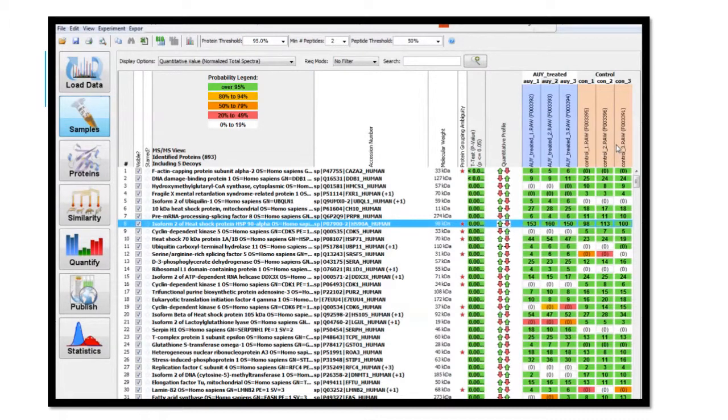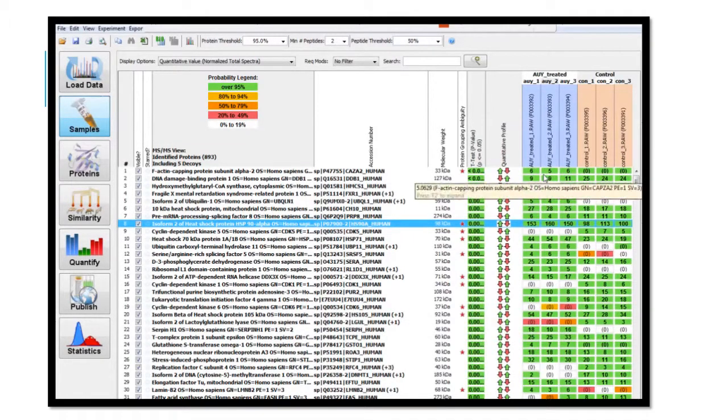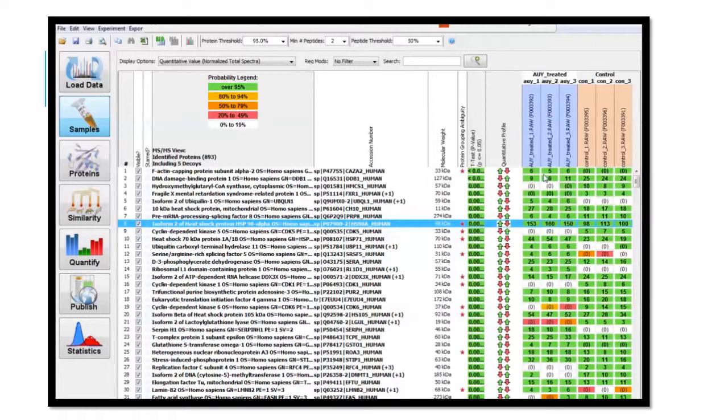To interpret the data, evaluate the numbers of the treated versus control cells. The control cells receive no drug, so they will be our normal in this interpretation.